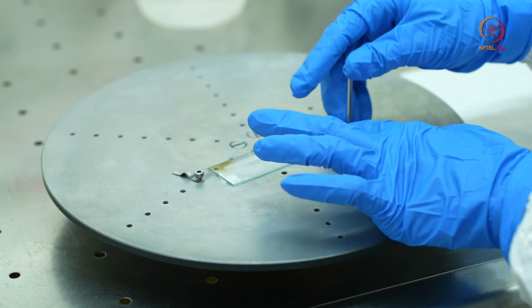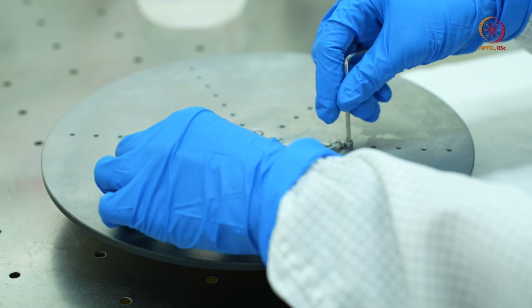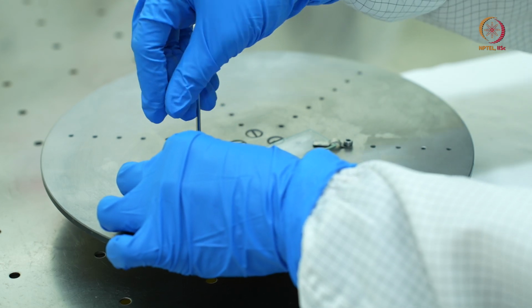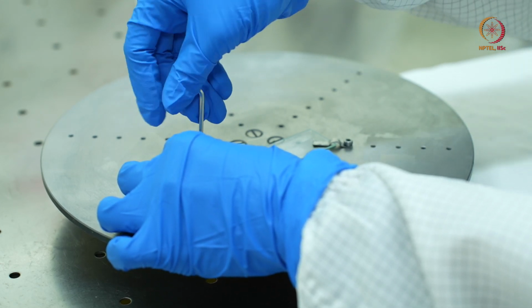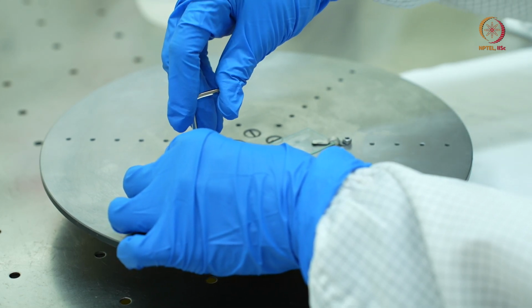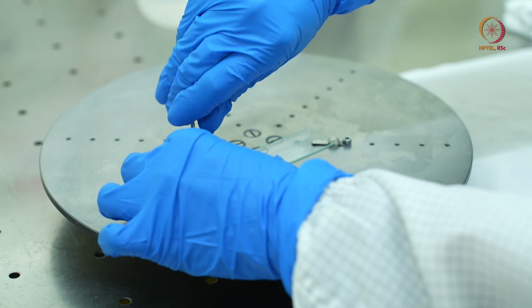This is the safest option to hold this sample, and we are doing this because we'll be placing this substrate holder upside down, so we want to make sure that our samples stay intact and do not fall while we are placing the samples in the chamber.